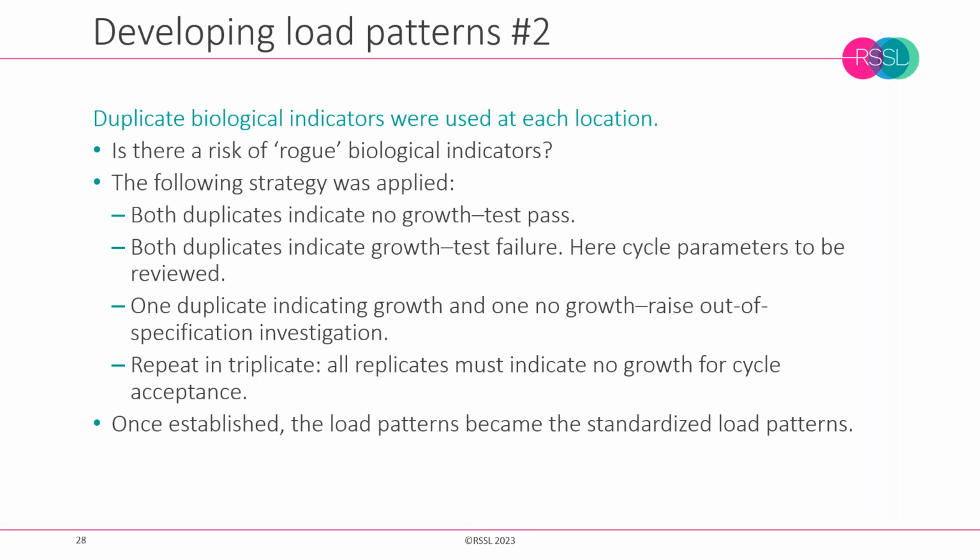There's then a general practice, particularly with hydrogen peroxide and isolators, of using duplicate or even triplicate biological indicators, whereas with a steam sterilization device, we would tend to go for one biological indicator in one location. And this goes back to when biological indicators for isolators were less consistently produced, and the rogue biological indicator phenomenon was more common. These days, biological indicators are made more consistently.